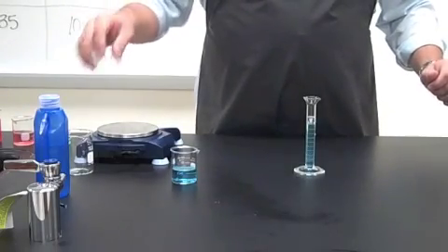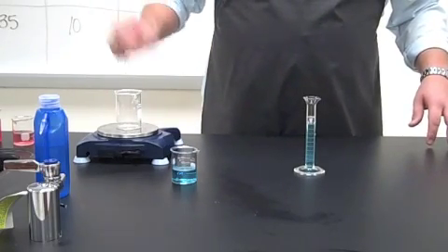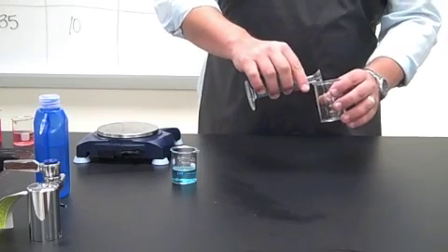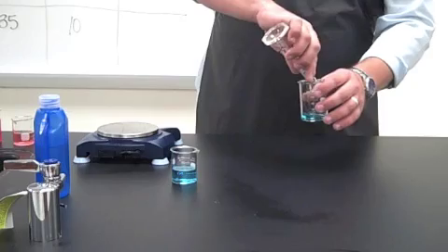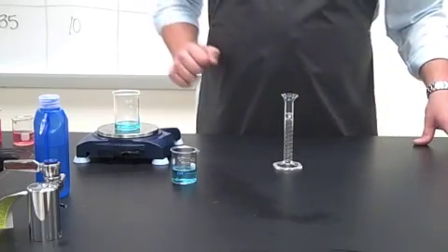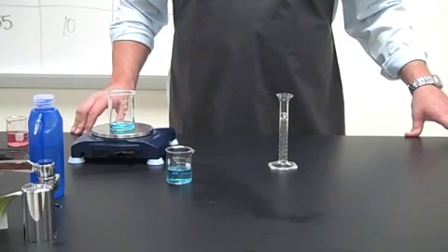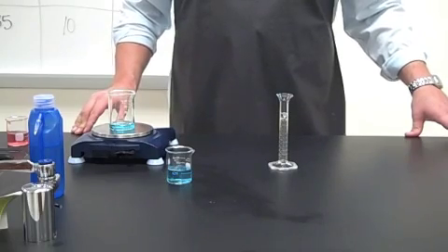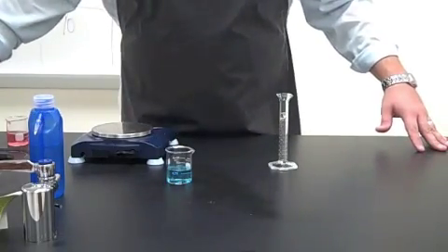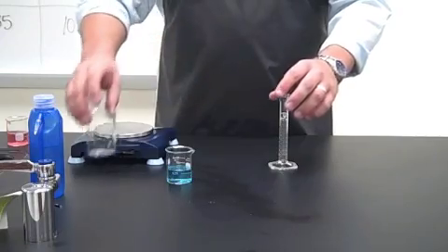Now that we've measured out 10 milliliters, we're going to take our 100 milliliter beaker again, put it back on our balance, zero it again, and then pour in the 10 milliliters of the 5% sugar solution. We put it on the balance, and we record its mass. We see that it has a mass of 10.06 grams. We can go ahead and pour this down the drain again. Make sure every time you pour it down the drain that you put a little bit of water behind it just to wash it down nice and good.